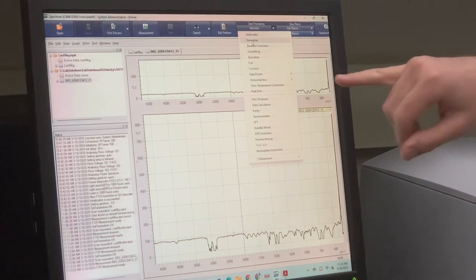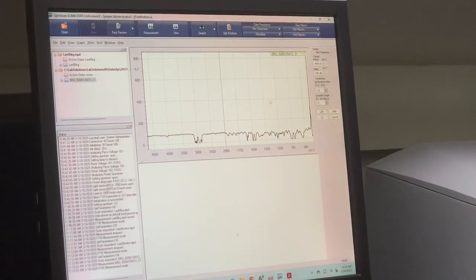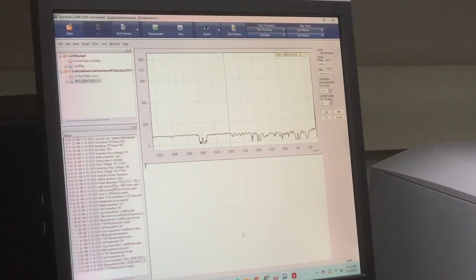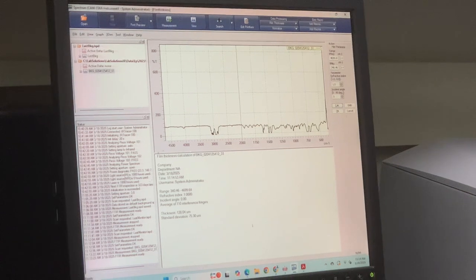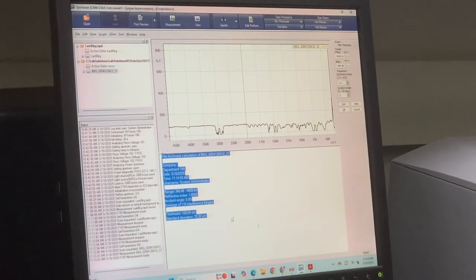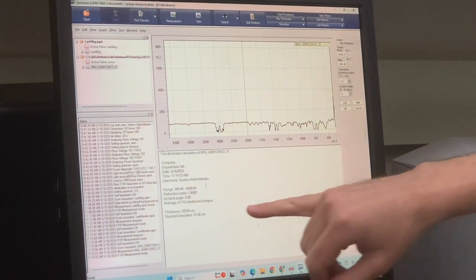Can you check on thickness? Looks like it. I think there's a special attachment for that, so I'm not sure if it's going to work for this. Okay, just as a film calculator, here is that. Film thickness calculation of the background file. It's kind of nonsense.